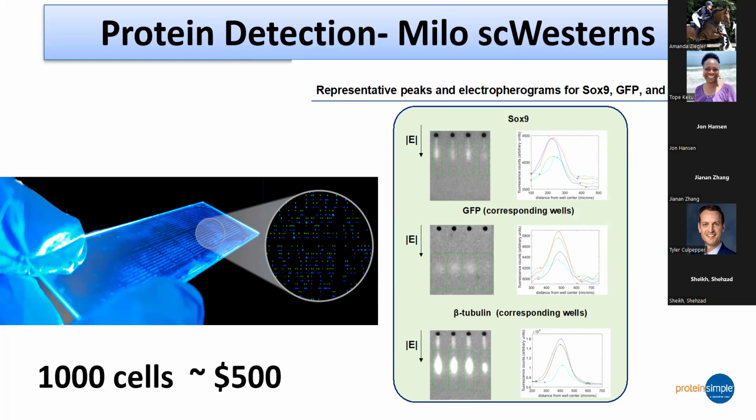So what you essentially do is you bring your single cell suspension, or we can FACS sort cells for you. We apply it, we let them settle down in those wells, wash off what doesn't get into one of the wells, and then you run it just like you do with a standard Western blot. It runs through an electrical field in a denaturing solution. Then after you've run your single cell samples out, we can probe the slide using fluorescent antibodies.